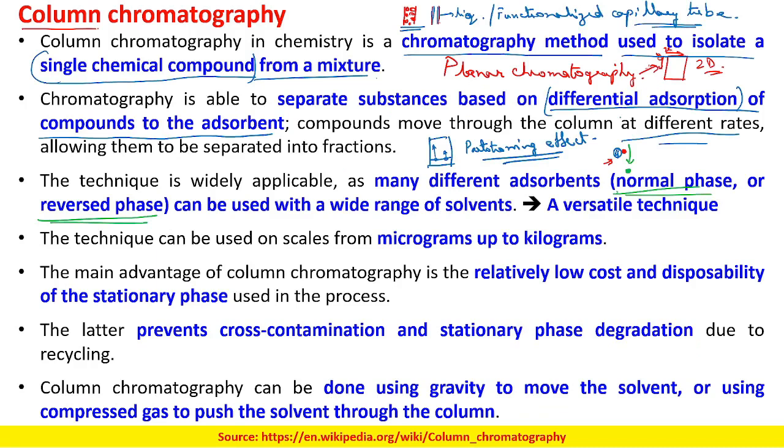In the normal phase, our adsorbent layer or stationary phase is hydrophilic in nature, whereas in the reverse phase, our stationary phase is hydrophobic in nature.